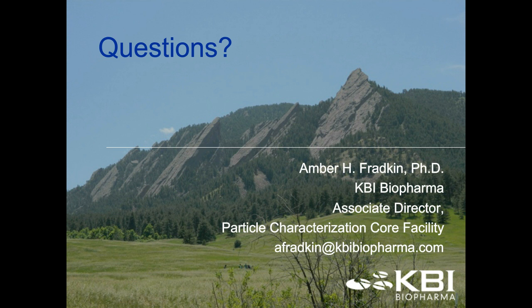Well, again, a lot of it depends on what the particles are. As I mentioned, for inherent and intrinsic type particles, nanoparticle characterization can actually give you a heads up. It can really be an early warning. If you start to see formation in the nano size range, we generally see those progress and form the subvisible and even potentially visible as they reach kind of equilibrium. So for certain scenarios, characterizing and monitoring nanoparticles can be quite helpful.